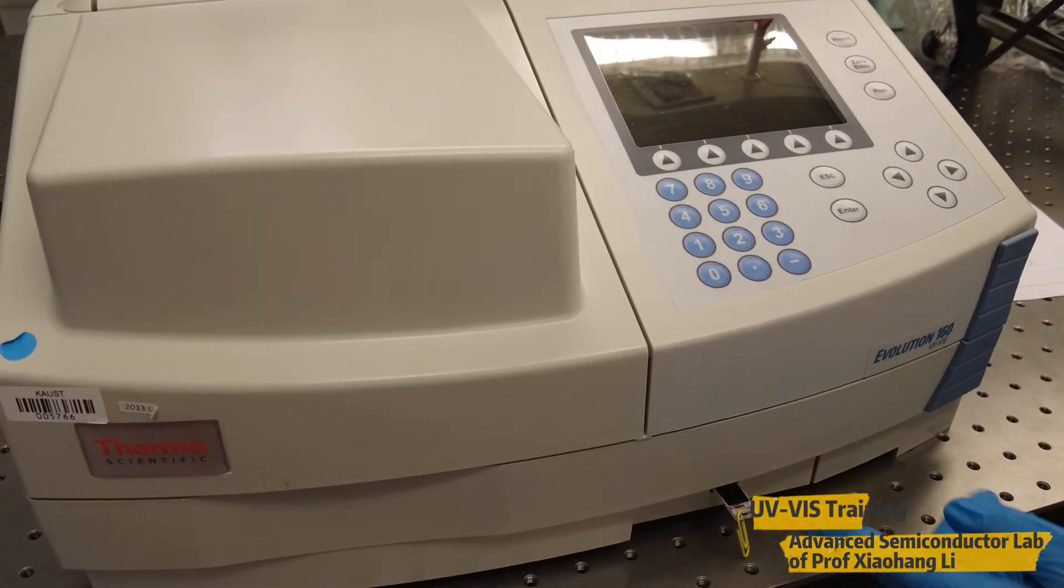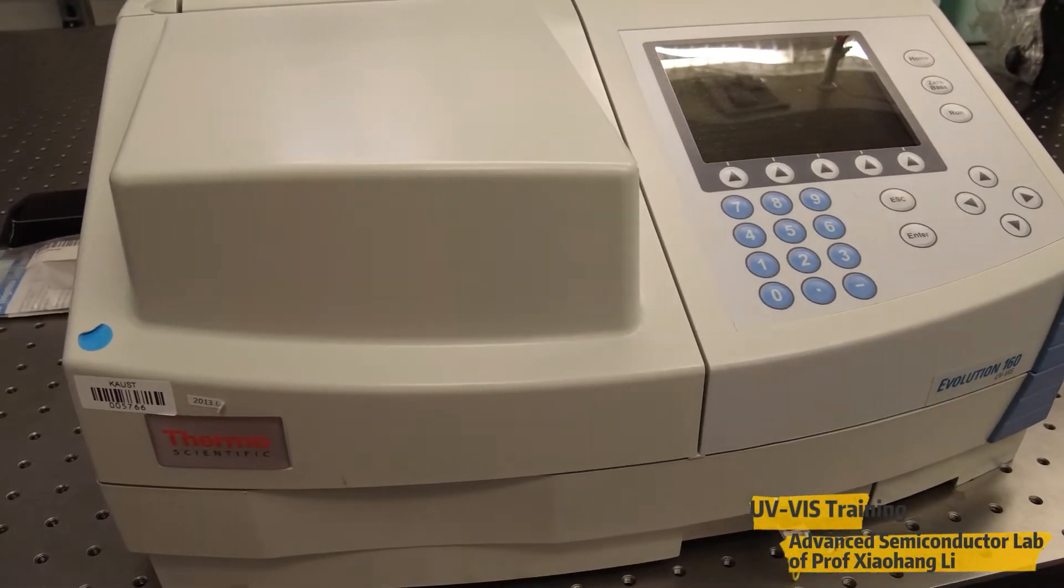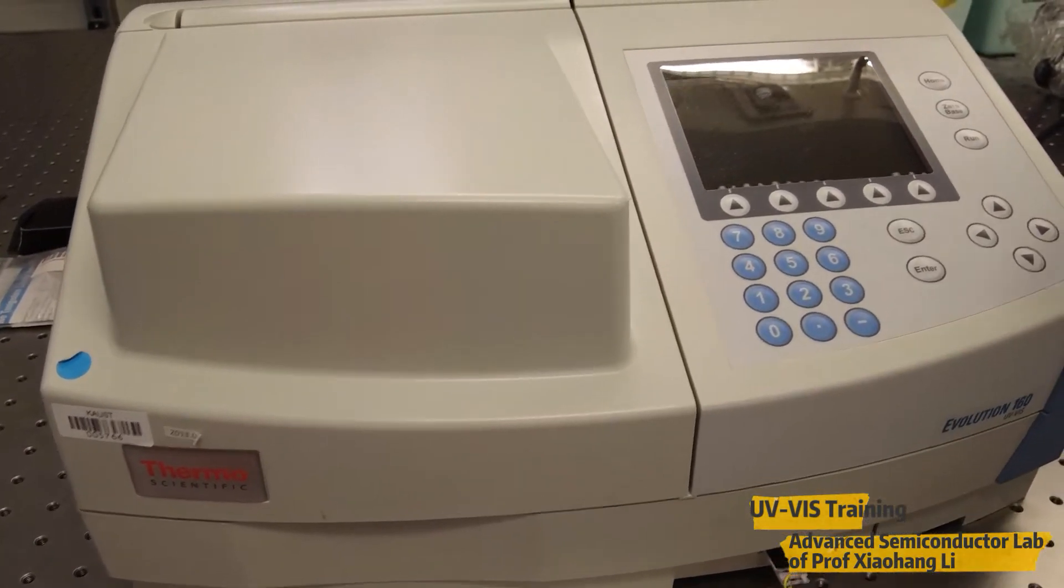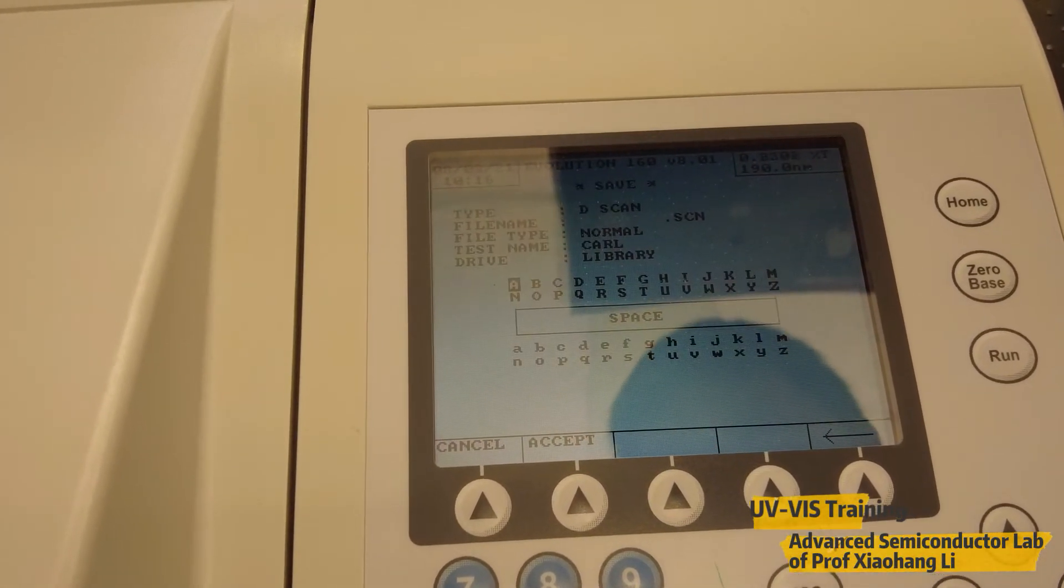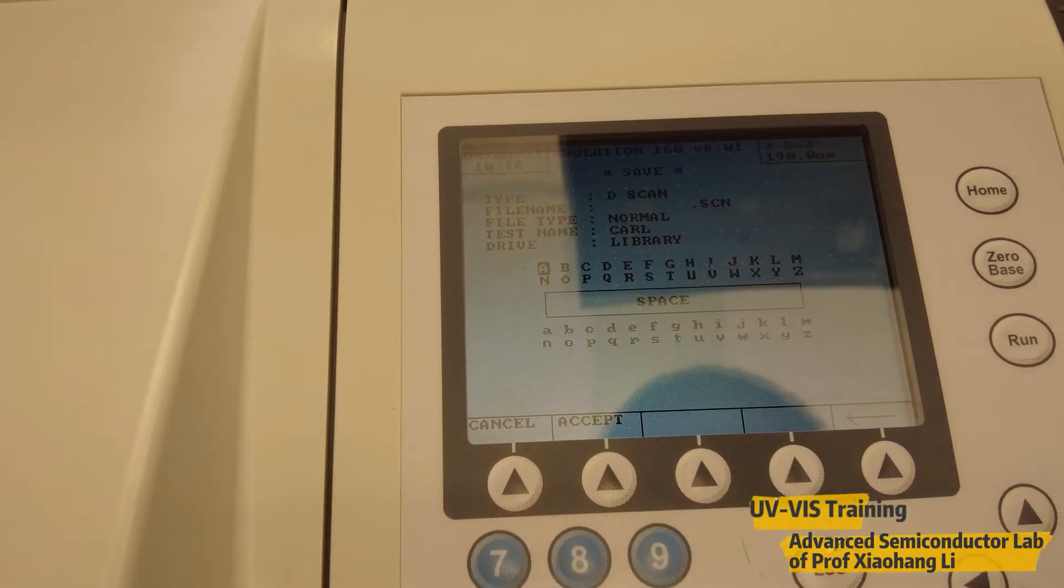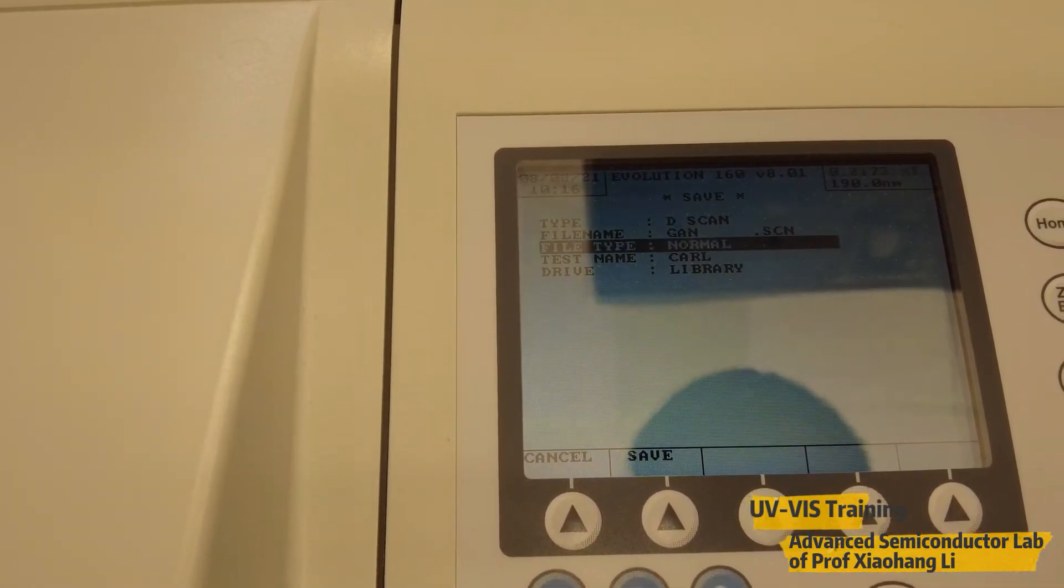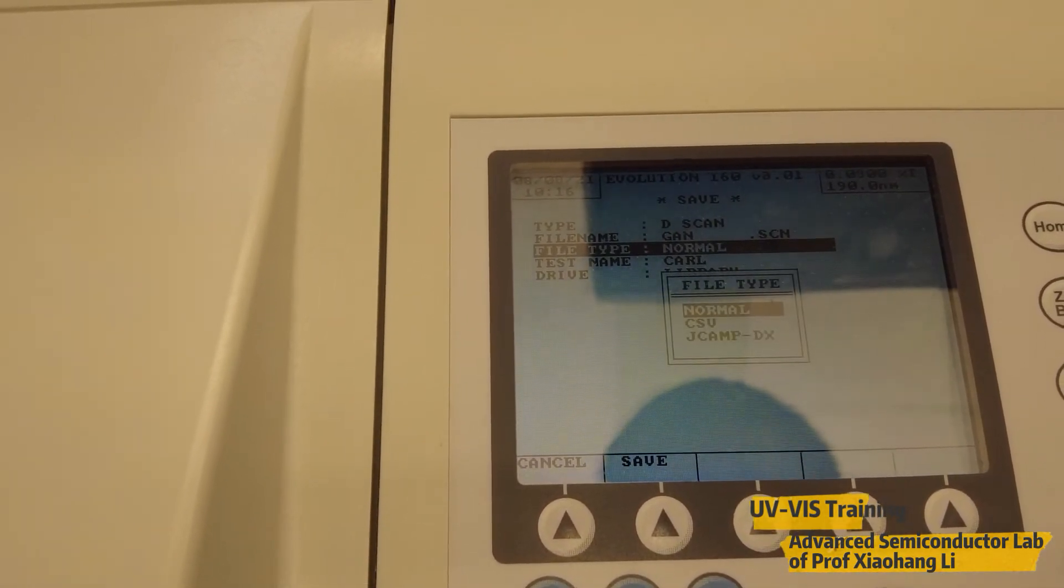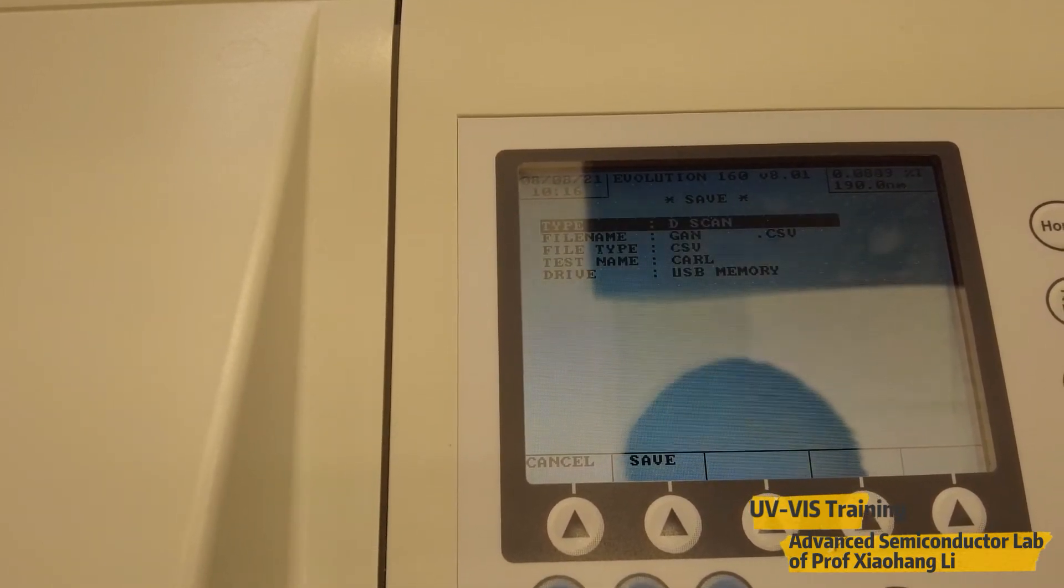There's a USB port from here. By the USB we can output our measurement data. Let's save our data. By pressing save data, we can give a file name such as gallium nitride. Then we can accept. Here we choose the file type. We can choose as CSV. We can open it with Excel, Origin and other software.